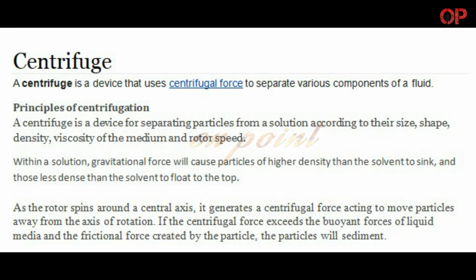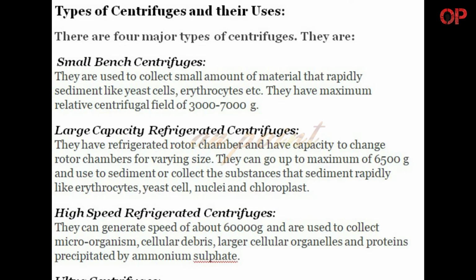As the rotor spins around a central axis, it generates a centrifugal force, acting to move particles away from the axis of rotation. If the centrifugal force exceeds the buoyant forces of liquid media, and the frictional force created by the particles, the particles will sediment. Types of centrifuges and their uses.